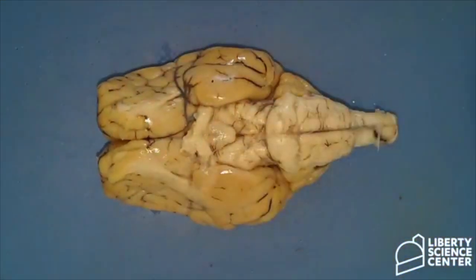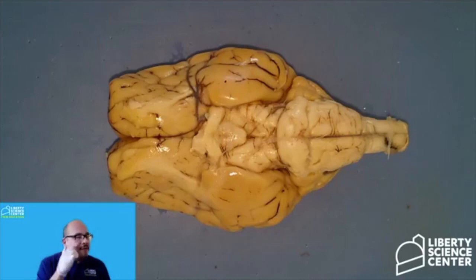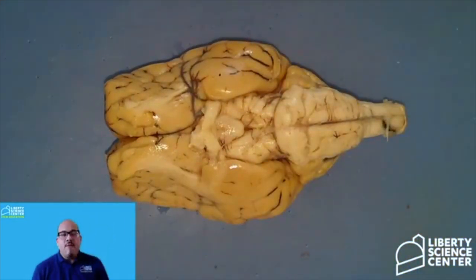The olfactory bulb is involved in detecting and determining different smells. Humans also have an olfactory bulb, which is pretty much lined up right where our nose is. You notice it's very thick here in structure for the sheep. Our olfactory bulb is not as pronounced, not as big as a sheep's, and that's because smell is super important for the sheep. In fact, any animal that has a very long snout relies a lot on smell, so their olfactory bulb, that nerve, is very large when we examine their brains.